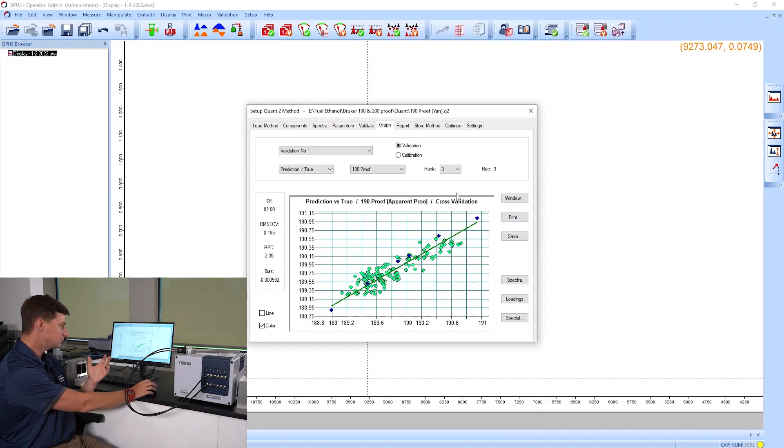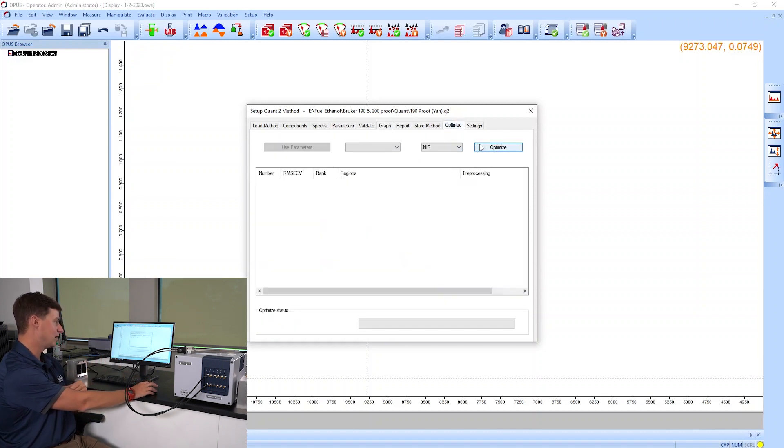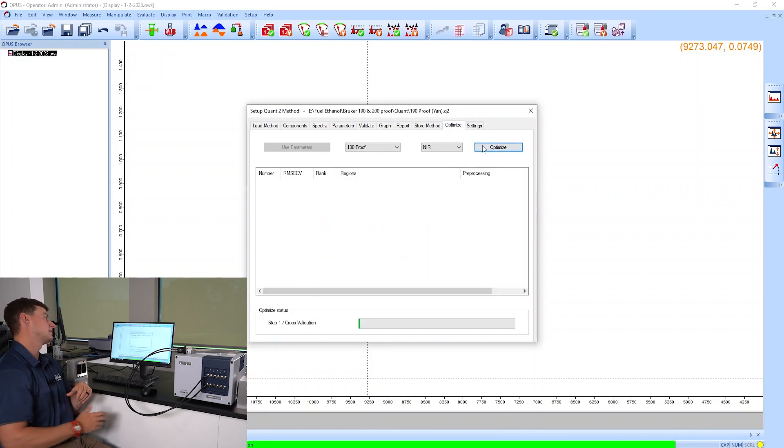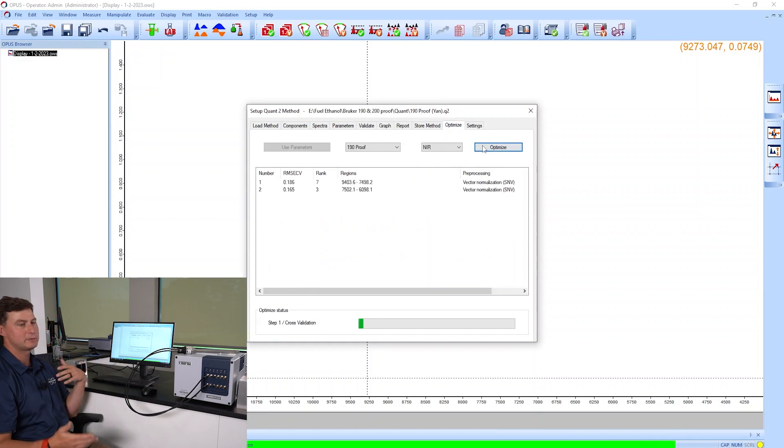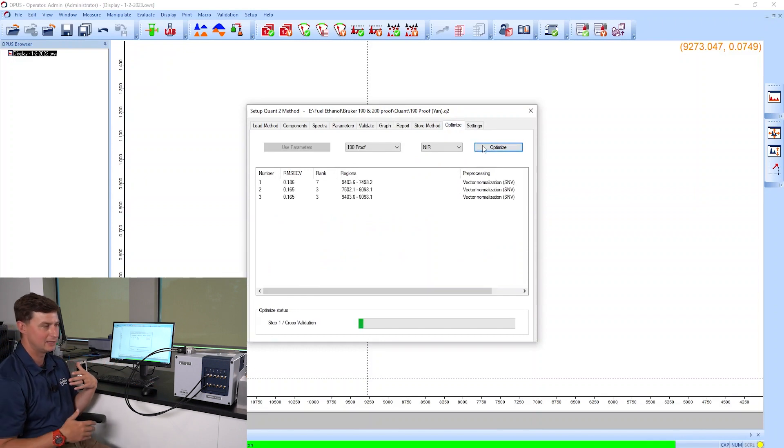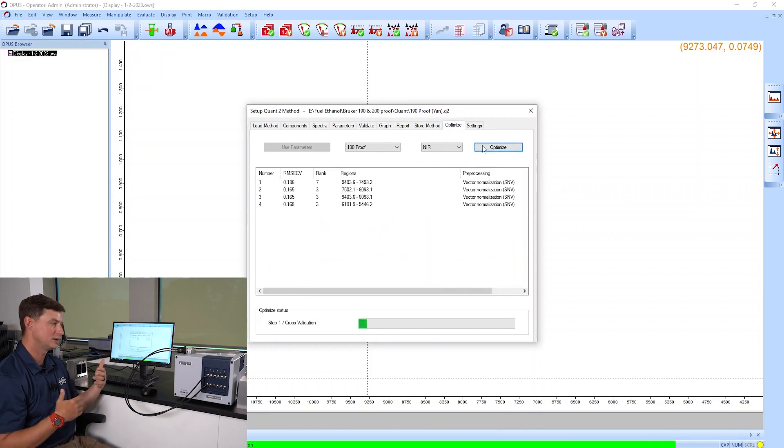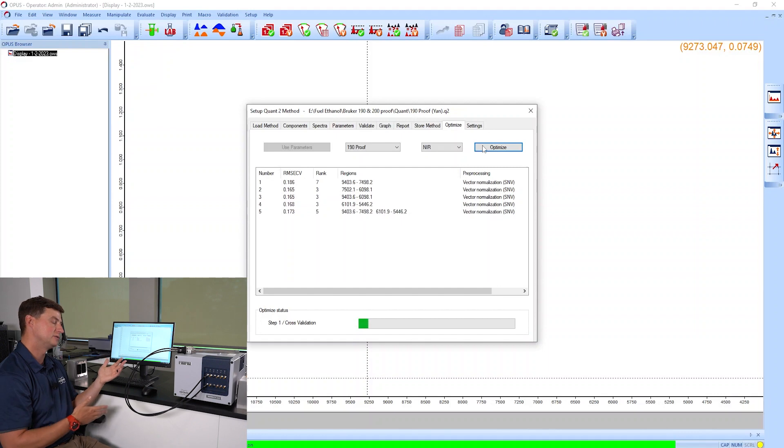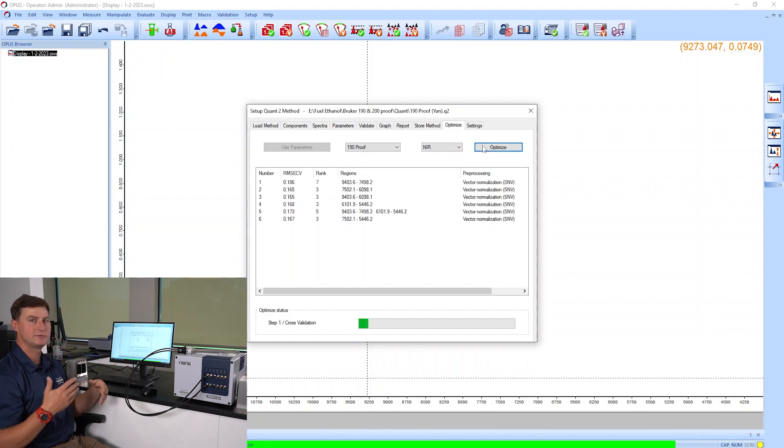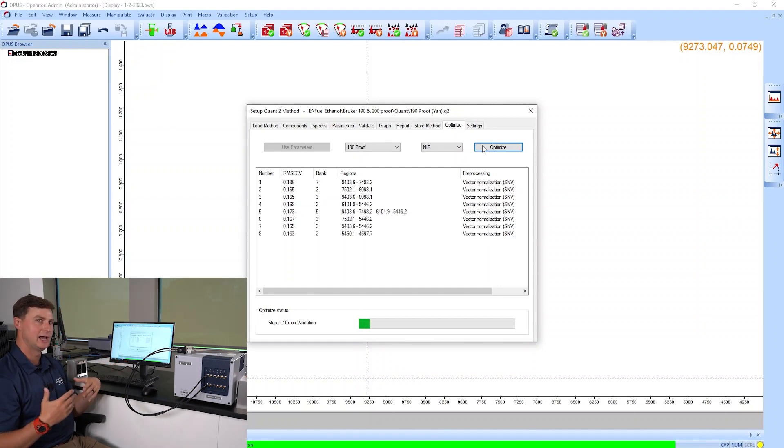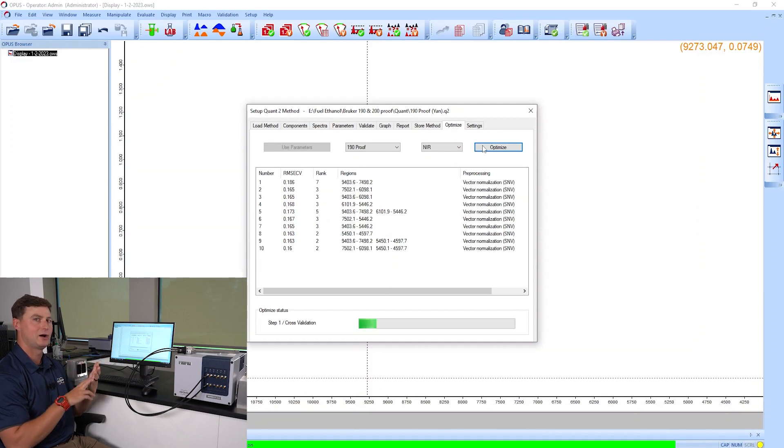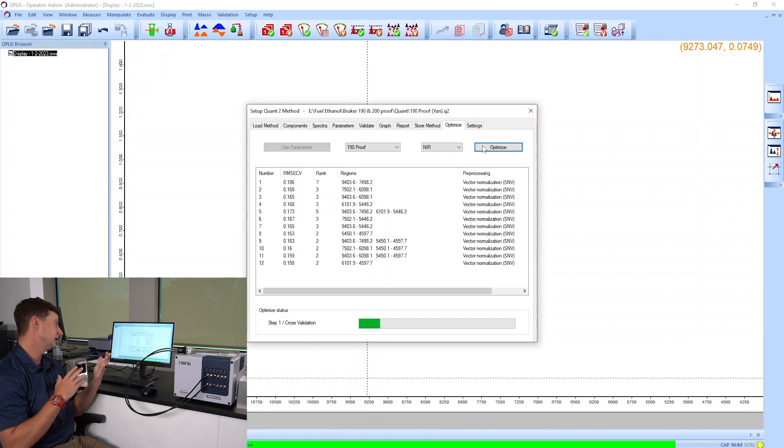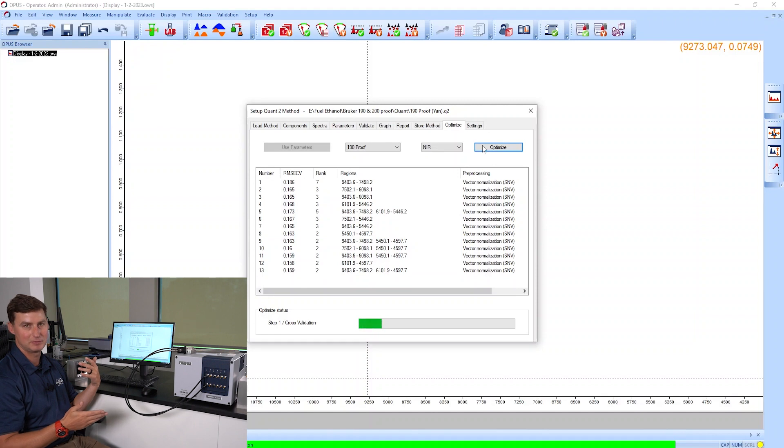Now we can make this a little bit better. With Quant2 we have the optimize feature, and the optimize feature allows you to look at different spectral ranges, different pre-processing techniques, and then it's going to display sorted by the error and the number of factors in the calibration. You get to choose which one you think is going to work best for you.